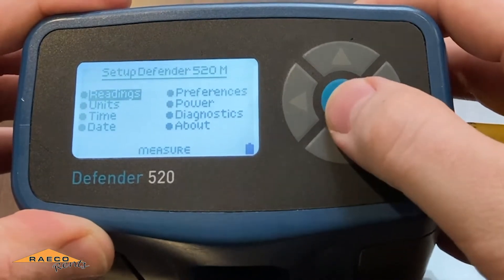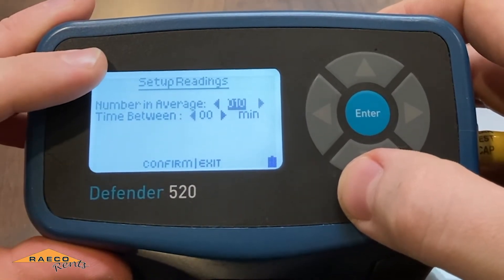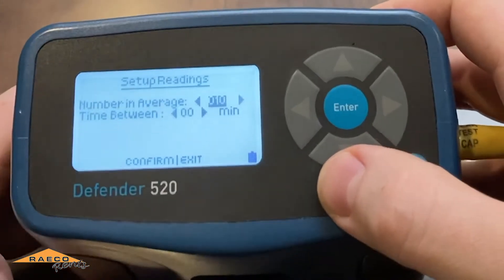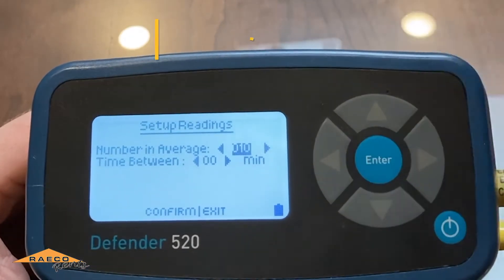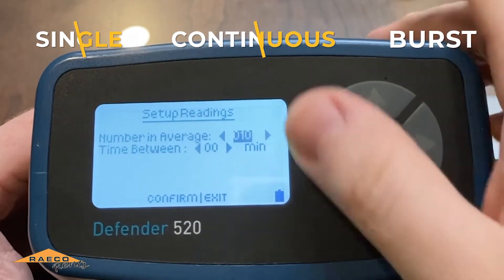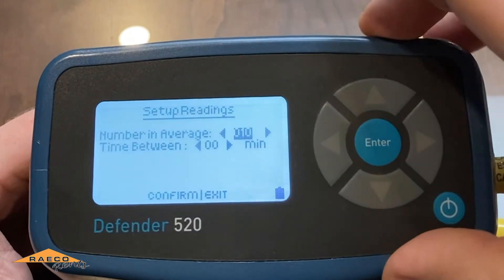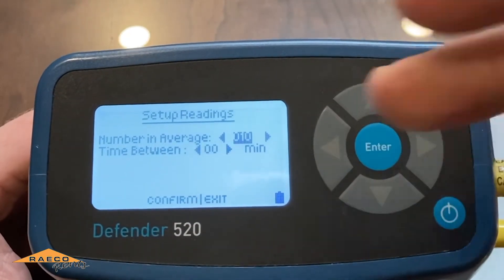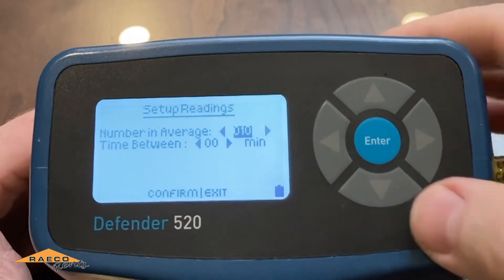Something to note is the number in the average. In the readings portion of the setup menu, there are three different measurement modes: single, continuous, and burst. This average number is going to affect the burst and continuous measurements — it will average whatever number you put in there. I'll show you a bit of that as we go into the calibration.